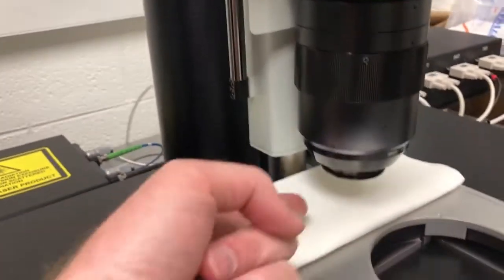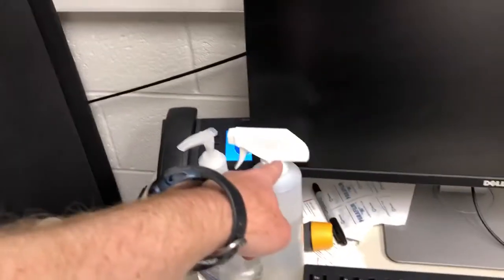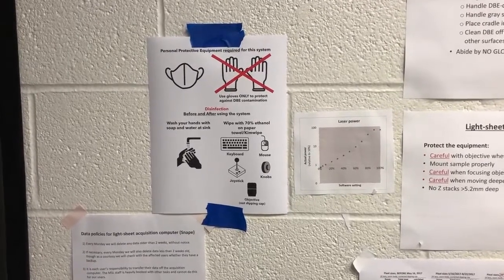And this part here of the objective, but not that part which dips into the DBE. So basically everything that we need to touch with our hands, we're going to use 70% ethanol to disinfect. It's not that easy for me to do that while I'm filming, so I'm going to pause, do that, and then come back to the next steps.